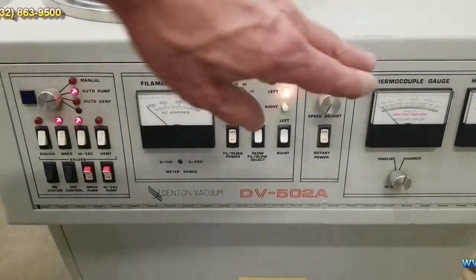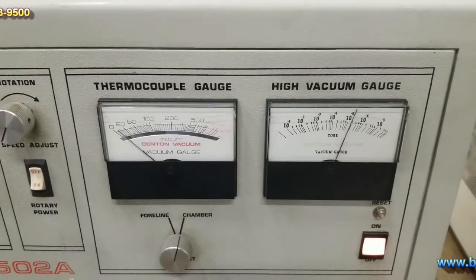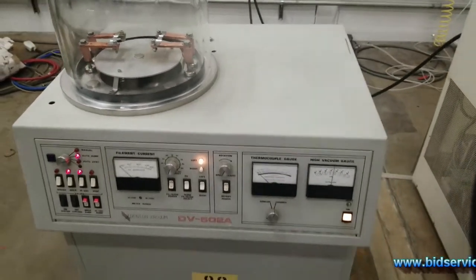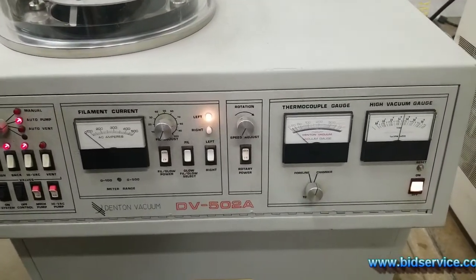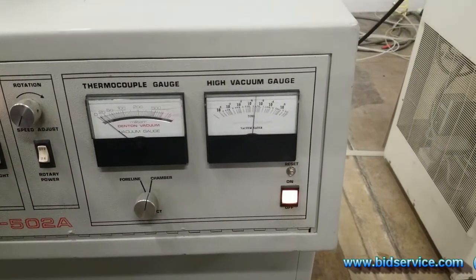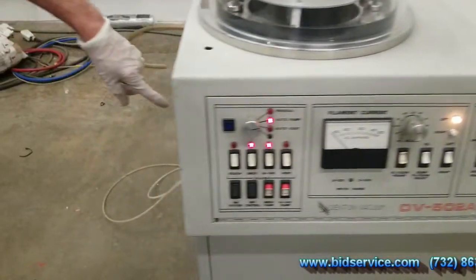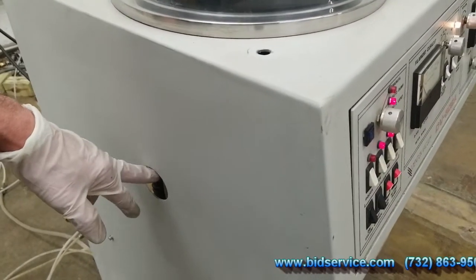We'll let it pump down for a while. We should normally reach around 2 to 3 times 10 to the minus 6 torr. As you can see we're down pretty close to that — about 3 times 10 to the minus 6. If you want to go any lower you can add liquid nitrogen through the port here; you'll need to attach a funnel and pour the liquid nitrogen in.